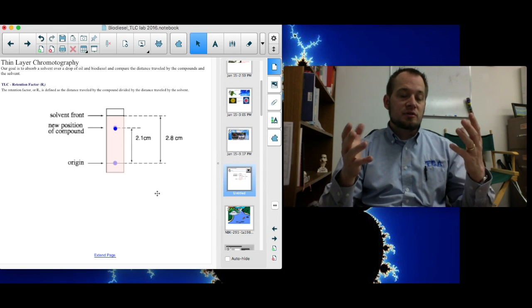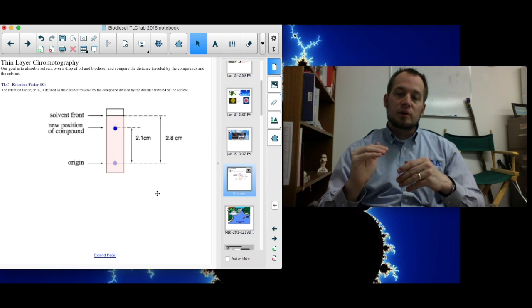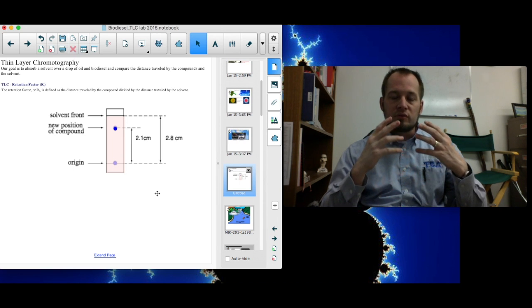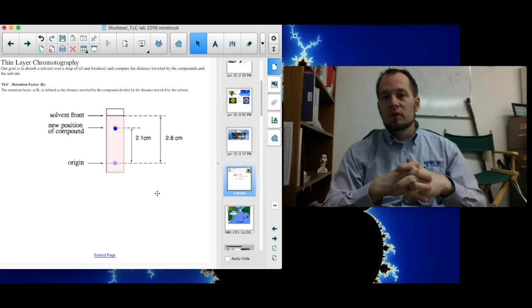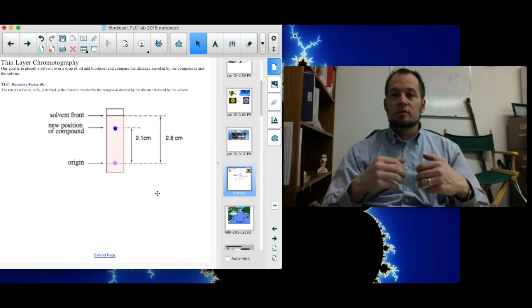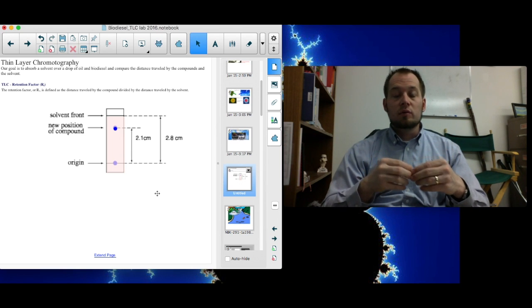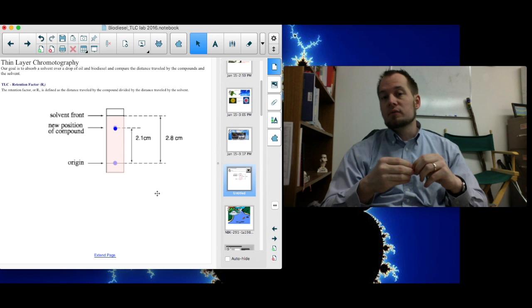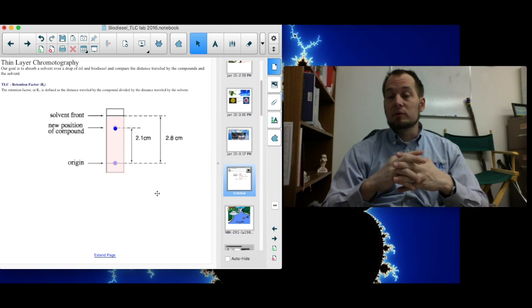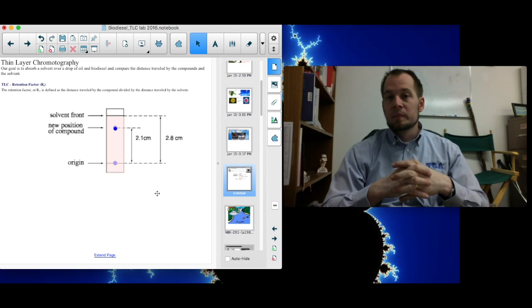Now, what you do is you take these and turn them into a ratio. You do 2.1 divided by 2.8. That number becomes what's called the retention factor, the RF value. That RF value is different for every substance depending on the solvent. So when we made this biodiesel the first time, we did this TLC test. We calculated the RF value for our solvent, and got the same number that other scientists had gotten. So we were able to confirm the fact that we made biodiesel as we had thought we did.